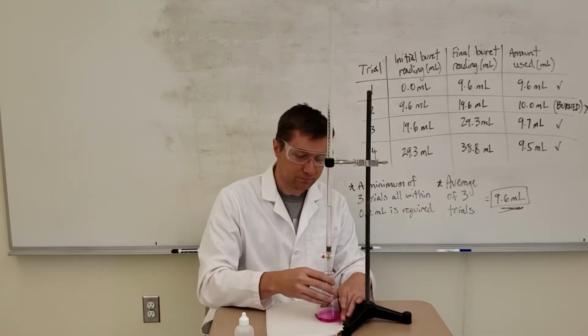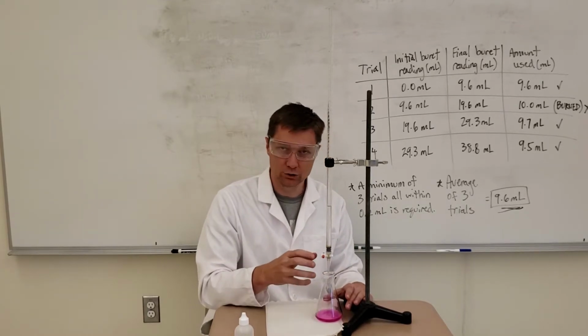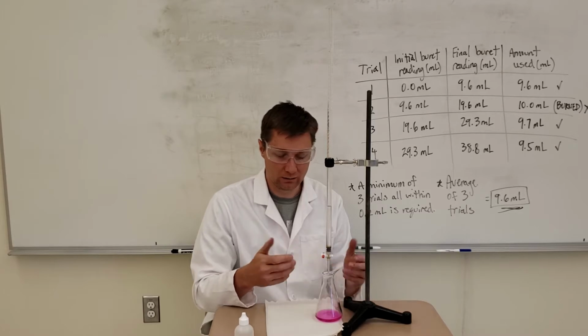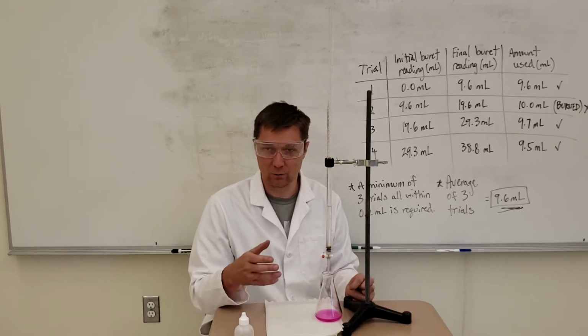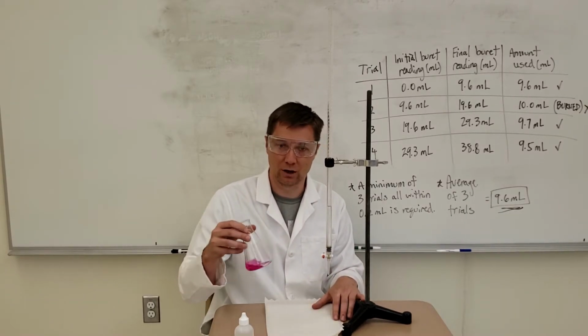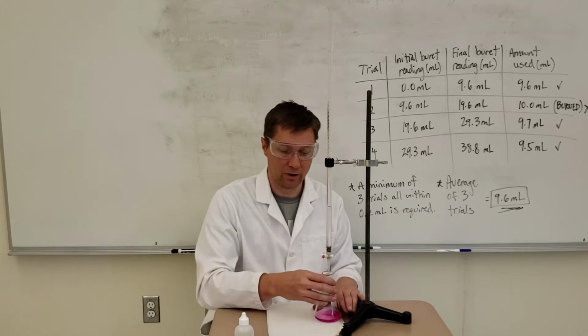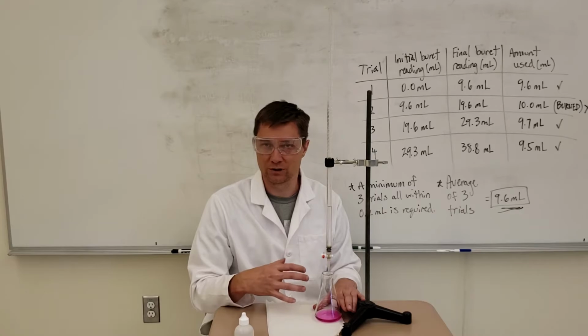And so you got to add it gently and slowly, 1 drop at a time, so that you don't burn the solution. I'll be right back with one that doesn't look burned, but that's what a burned solution is going to look like. I'll do one more example of myself kind of doing it a lot more slowly to show you what the persistent pink looks like.